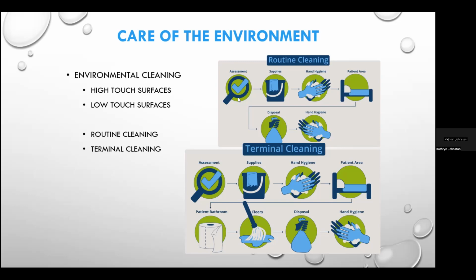And then they should clean, working from clean to dirty areas, as well as from high above to lower down. So the last area that should be cleaned in any area should be the floor. So that should be the last process that takes place.